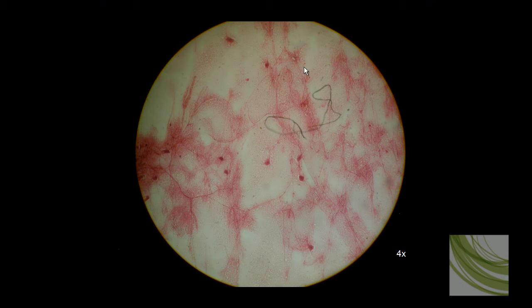For instance, we can see all these long hard lines which are axons. Now this little strand here is what we call an artifact. That's a fancy scientific way of saying it's a piece of dirt or fiber that doesn't belong there.